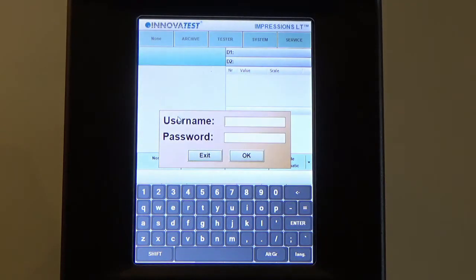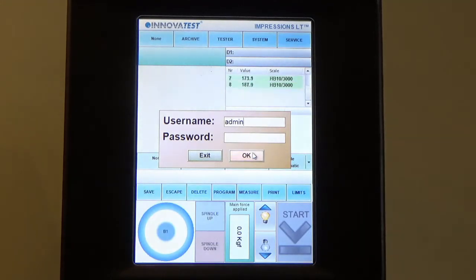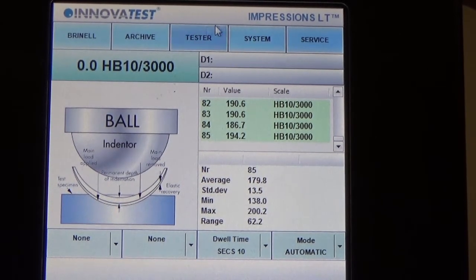You will reach a login page whereby you just need to key in 'admin' for the username and press Enter, and it will bring you to the main page for this software. This is the main page of the Impressions software for the 3200.